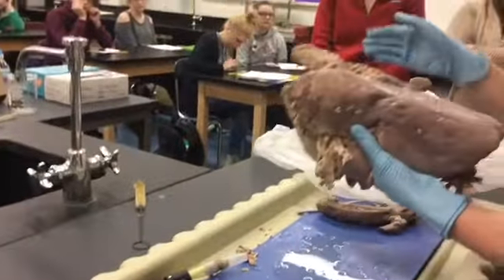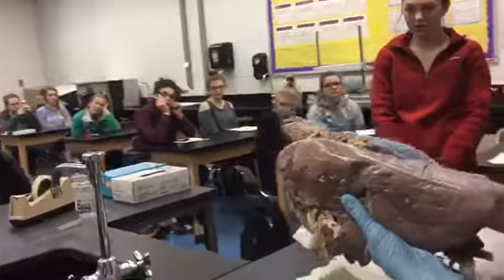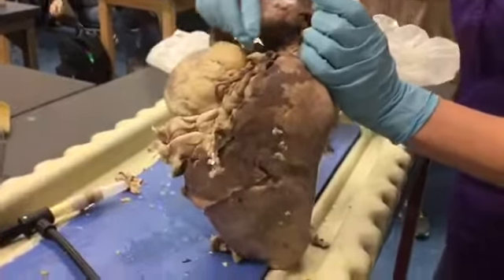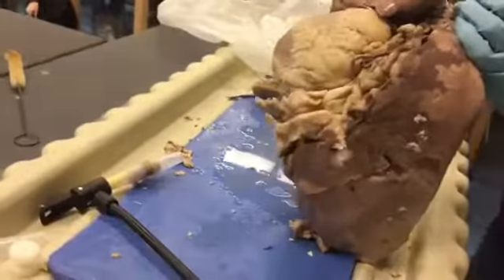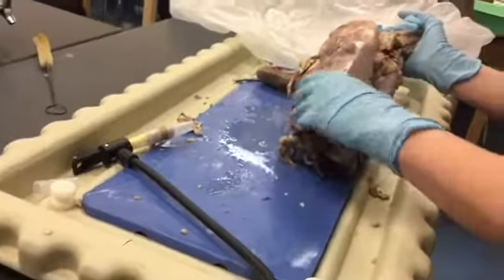So which one's my right lung? This side, side one, or side two? Side one. Yep, side one. And just like in humans, it is a three-ish lobed right lung: lobe one, lobe two, lobe three. The left lung has two lobes, lobe one right here, lobe two.